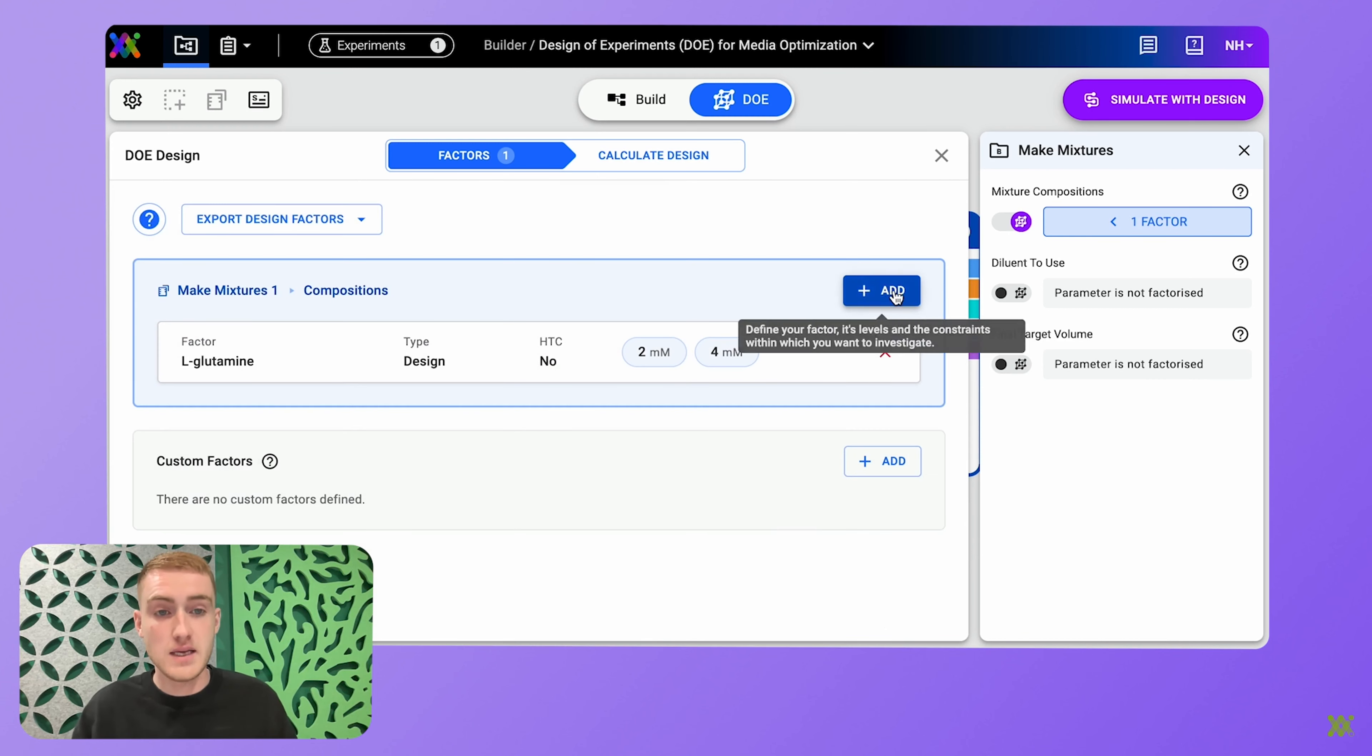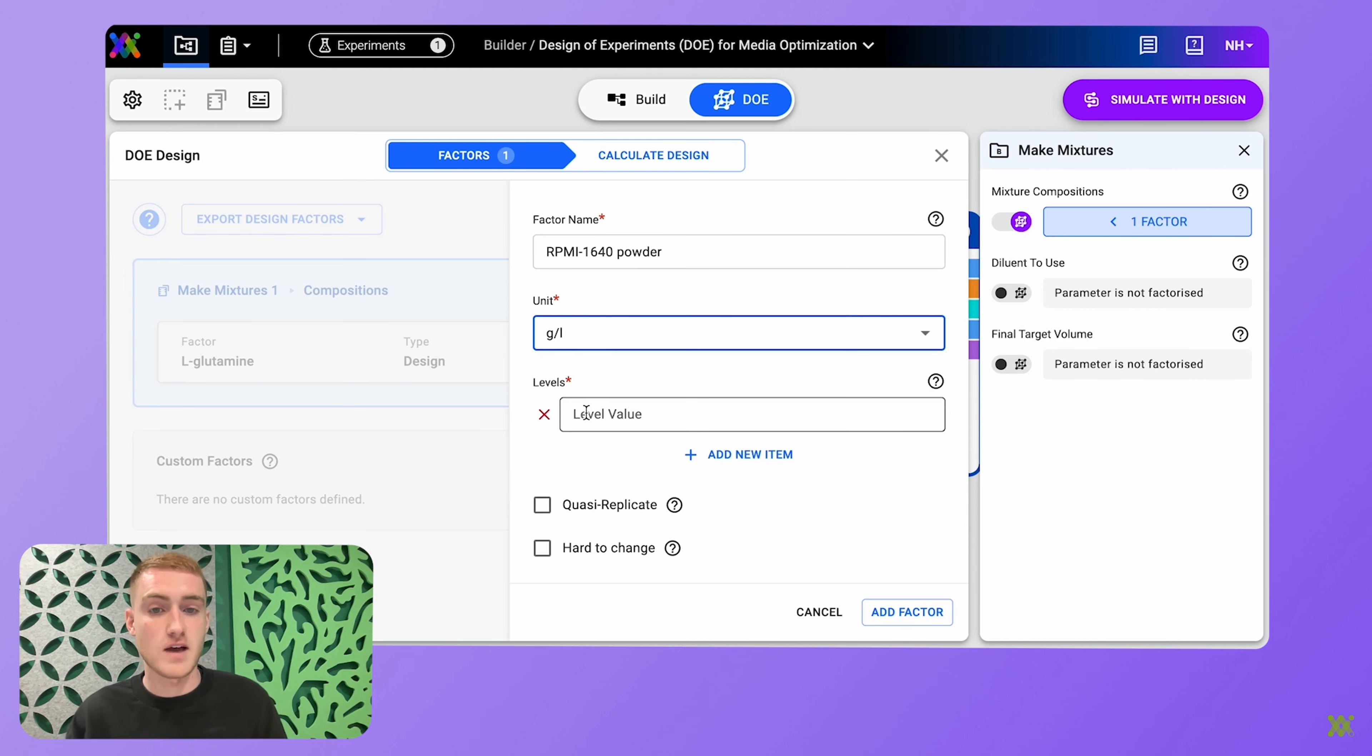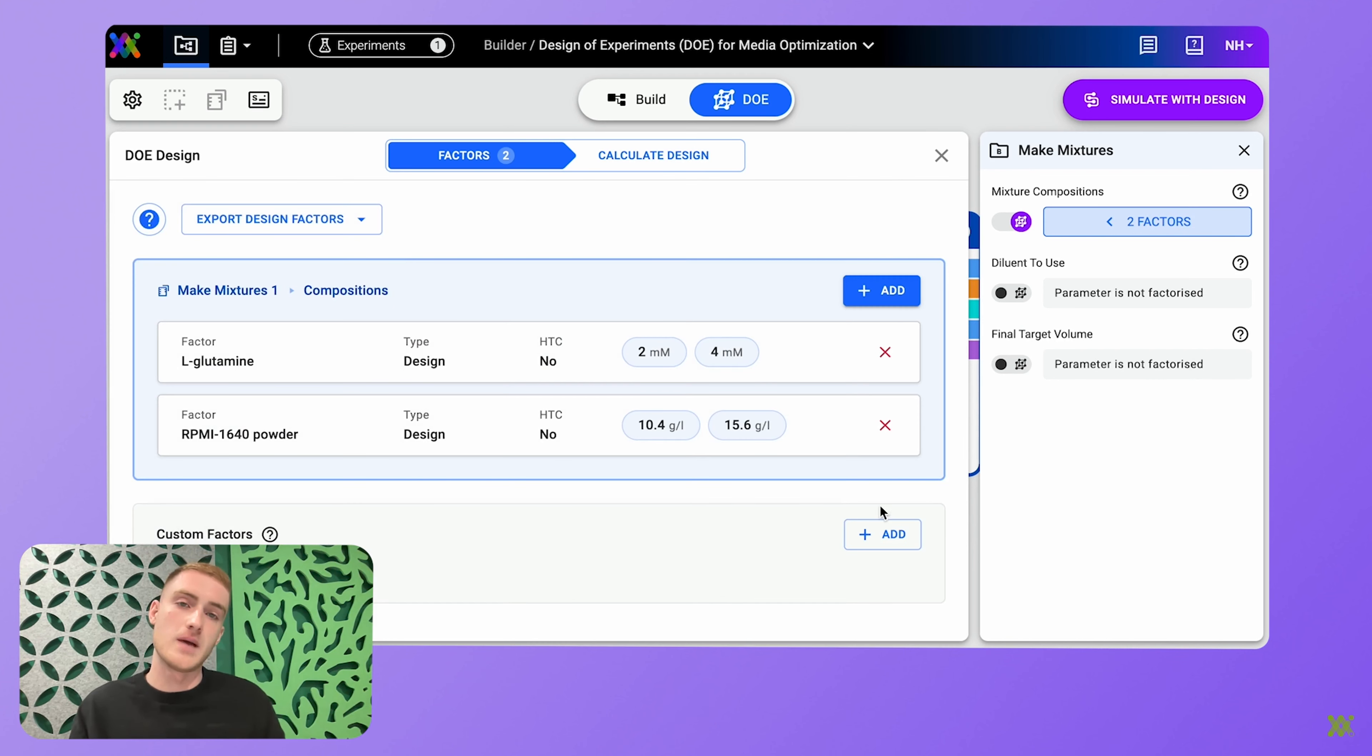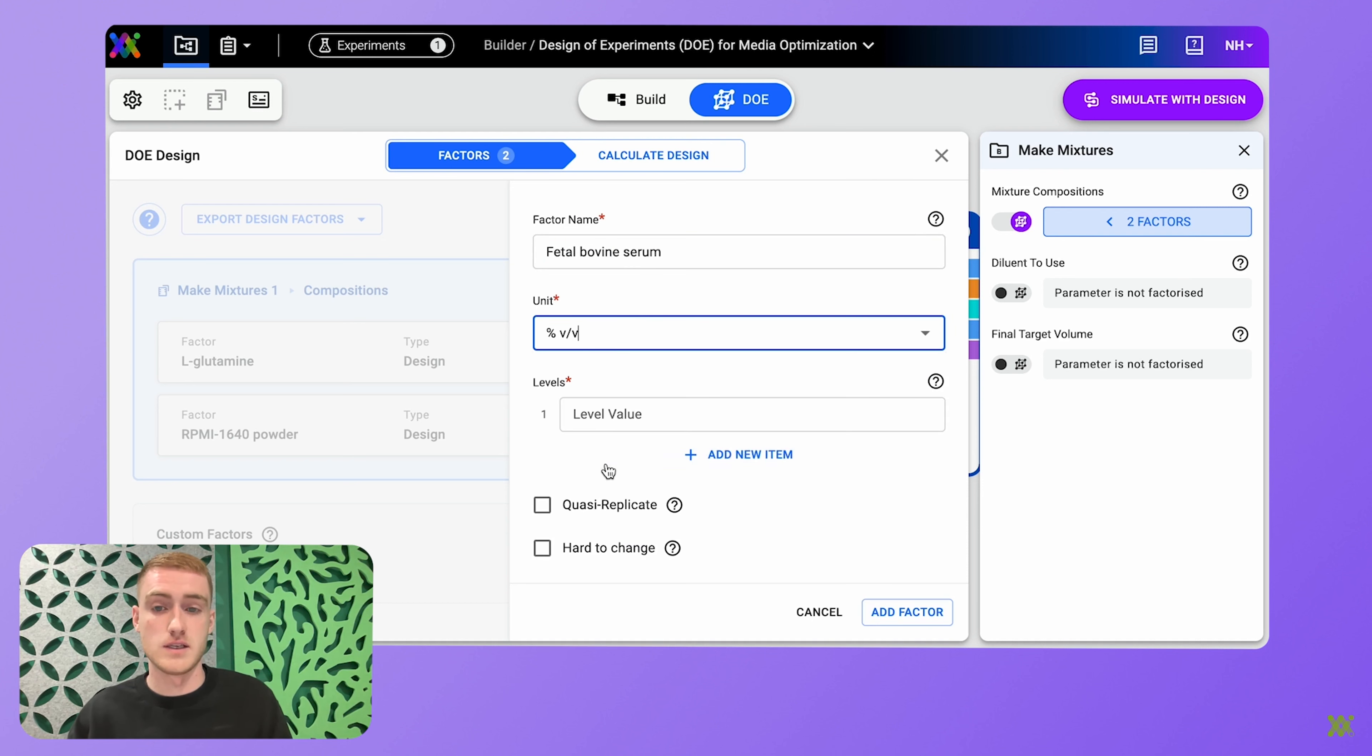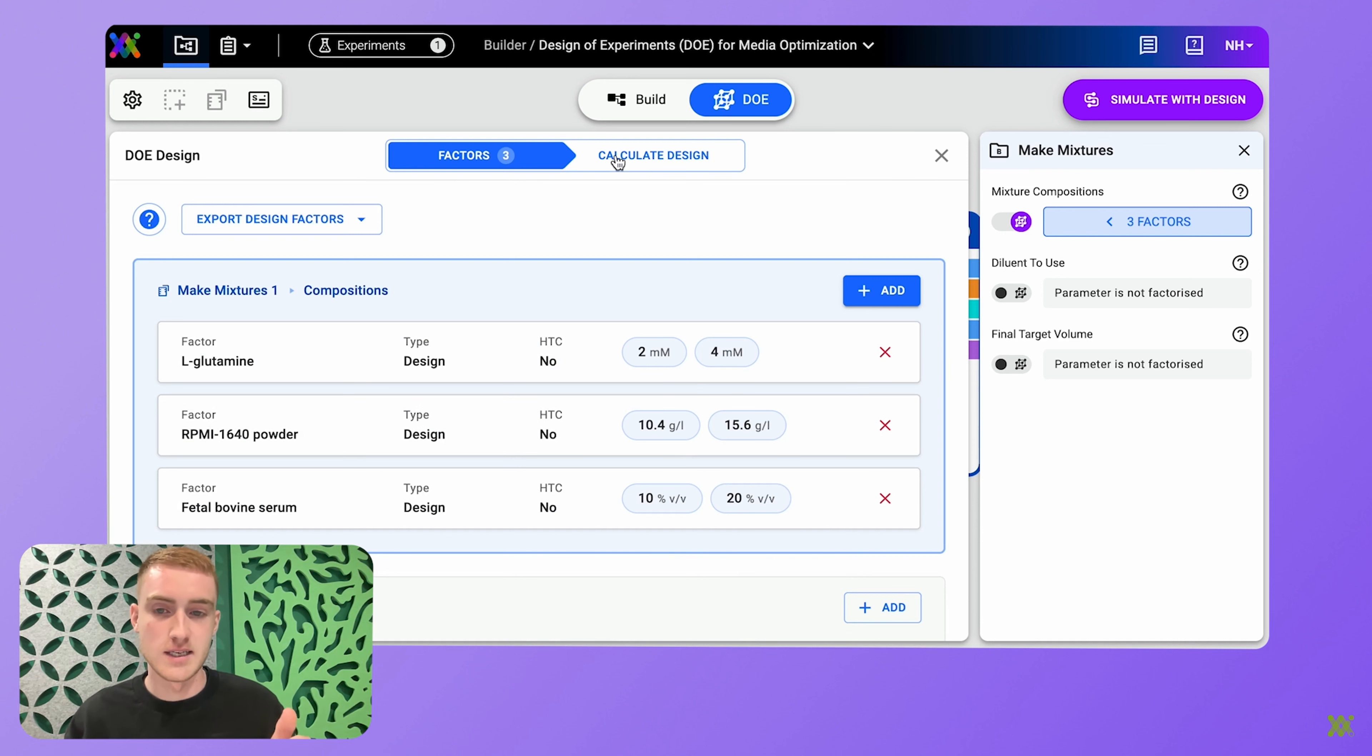From here, all I've got to do is enter the components that I'd like to add as factors to my DOE design, and then the specific concentrations or volume levels of each. So once I'm happy with that, I can hit calculate design.